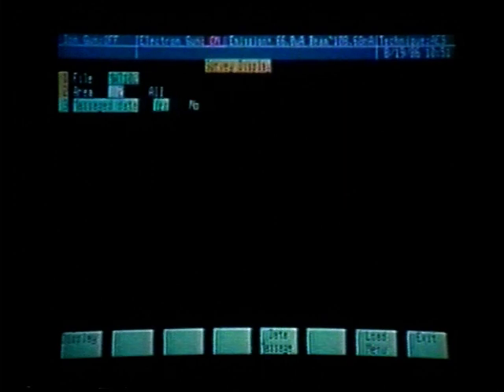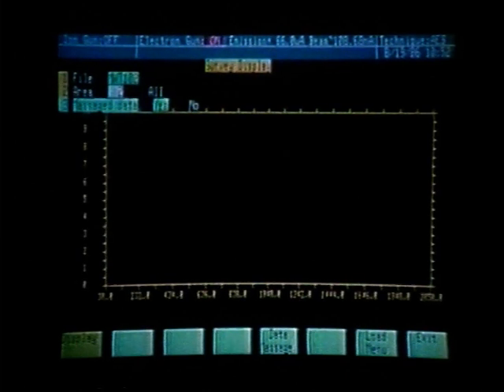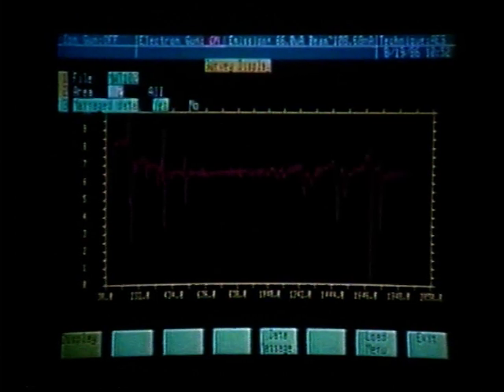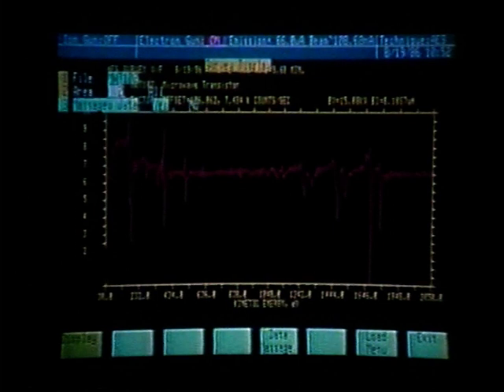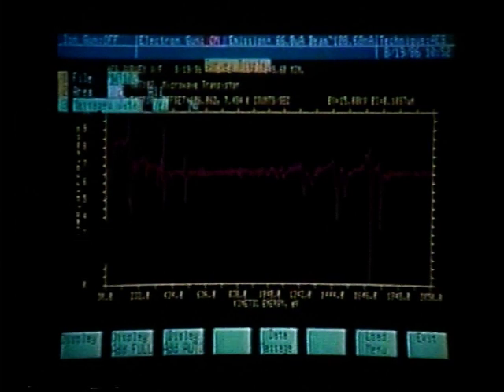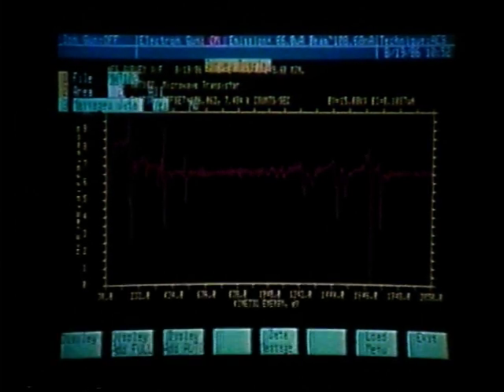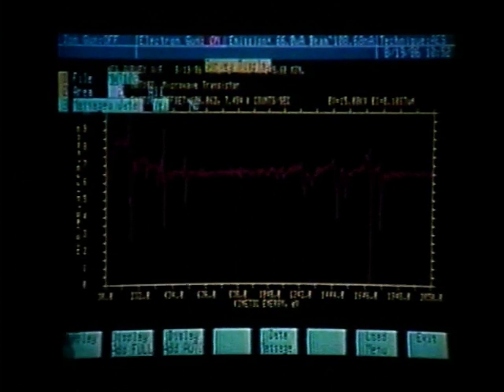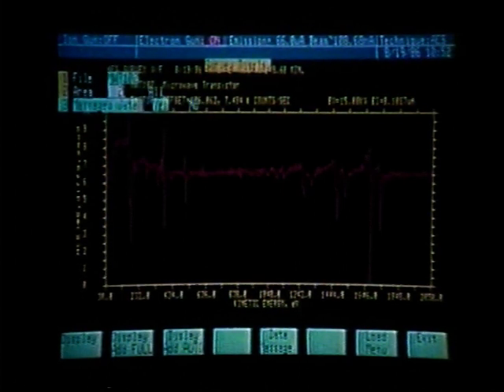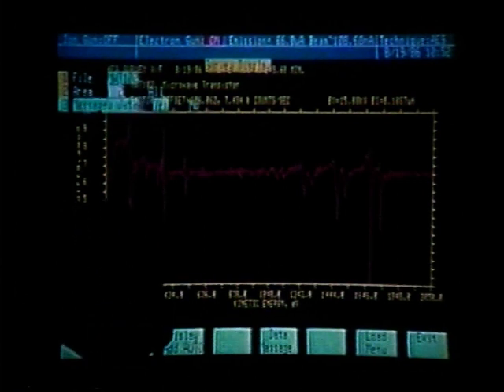Now we can use soft key number one to display that massage data. This is area number two. We have identified this peak as tantalum, this peak as carbon, nitrogen, oxygen, and tantalum peaks. A survey scan gives us a broad range which allows us to identify roughly the presence and absence of elements depending upon the signal to noise.